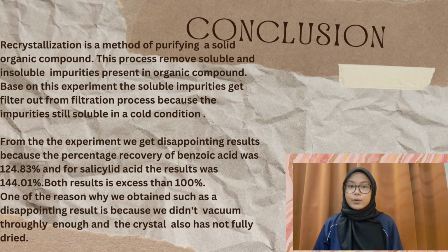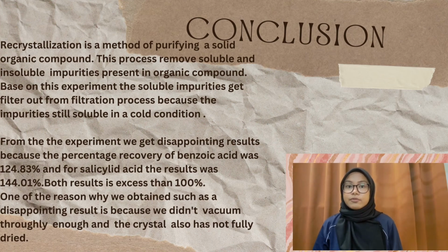From the experiment, we got a disappointing result because the percentage recovery of benzoic acid was 124.83%, and for salicylic acid, the result was 144.01%. Both results are in excess of 100%. One of the reasons we obtained such a disappointing result is because we didn't vacuum long enough, and the crystals also had not fully dried.